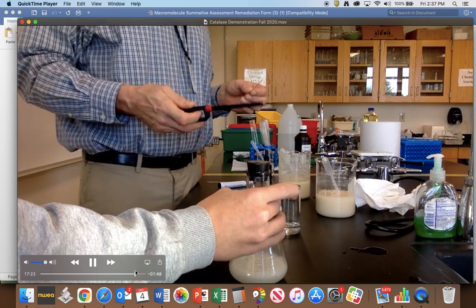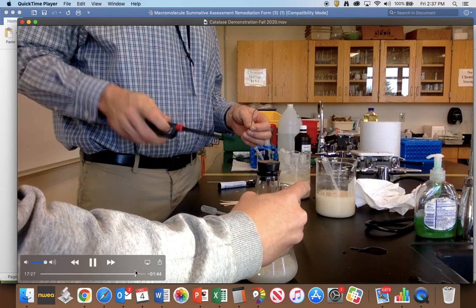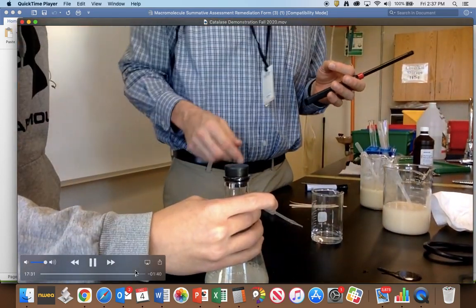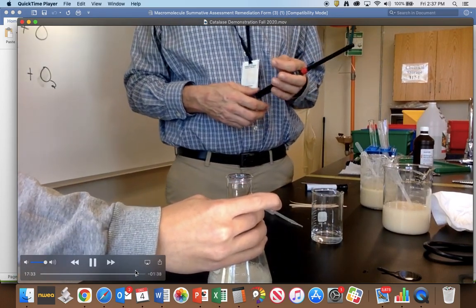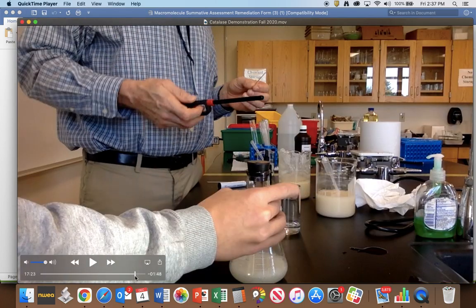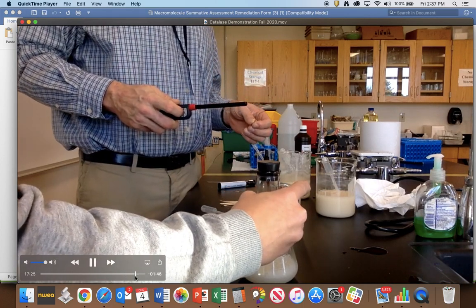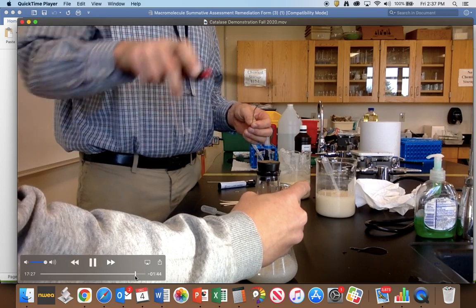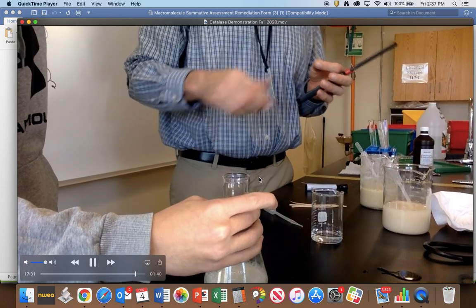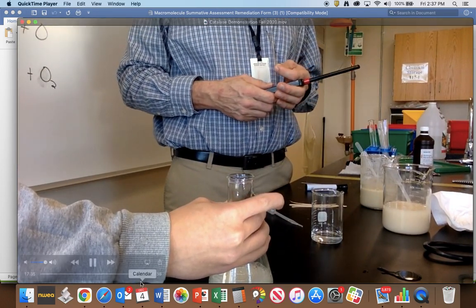So there's me lighting the stick. Now I'll move the computer. Oh, that didn't really help at all. Oh, look, the top blew right off. Let's just rewind that to see that happening. I'm going to move the computer and then watch this top right here. The top's going to blow. Oh, there it goes. It blew off because of all the gas buildup in there.